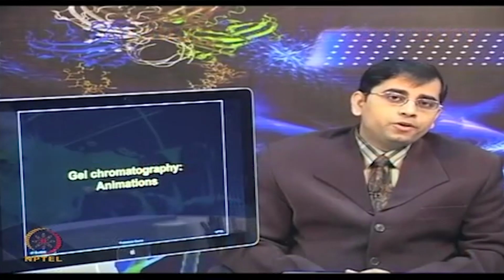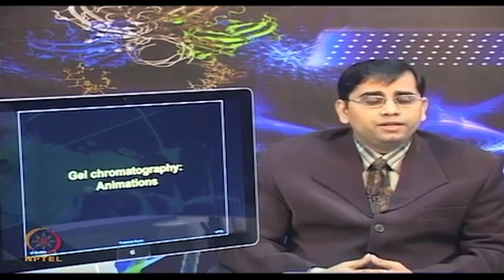Gel filtration chromatography is useful for removal of contaminants, doing desalting steps, as well as for buffer exchange. However, its drawbacks are its low capacity, broad distribution of pore size and small sample volumes to be analyzed.